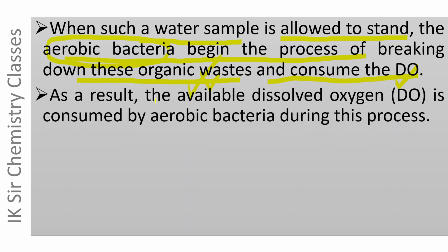As a result of this process of breaking down organic wastes present in the water sample by aerobic bacteria, the available dissolved oxygen is consumed by aerobic bacteria during this process.